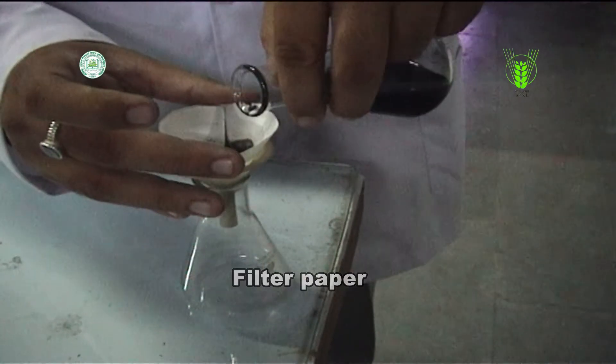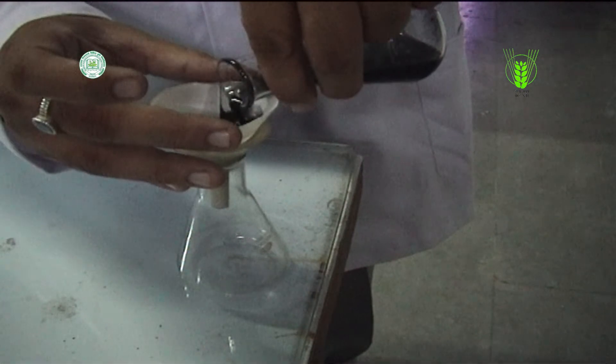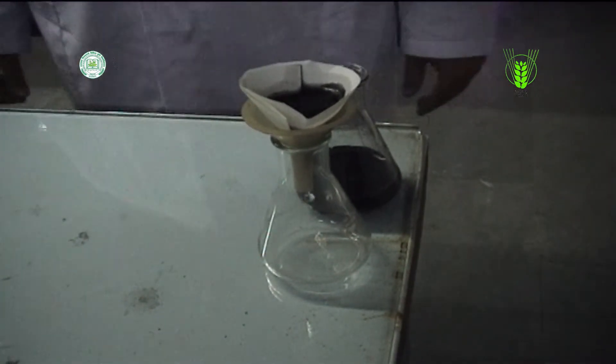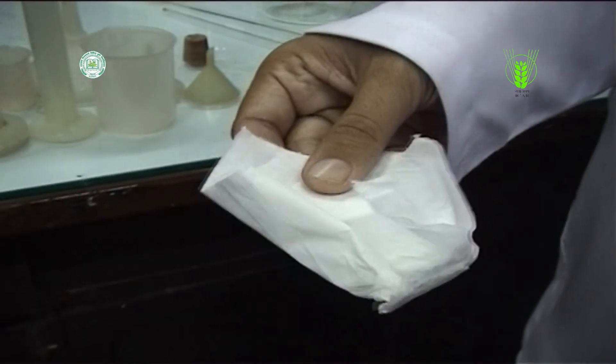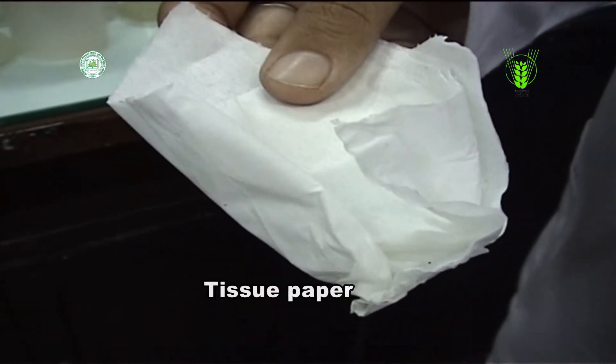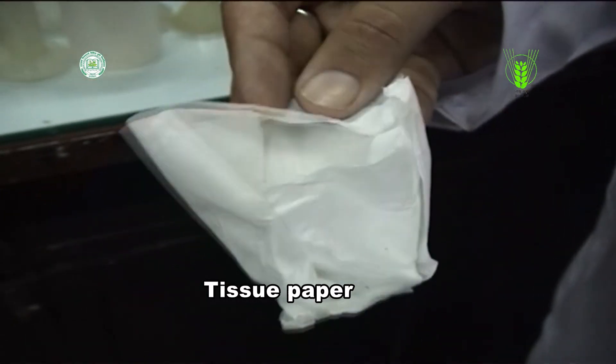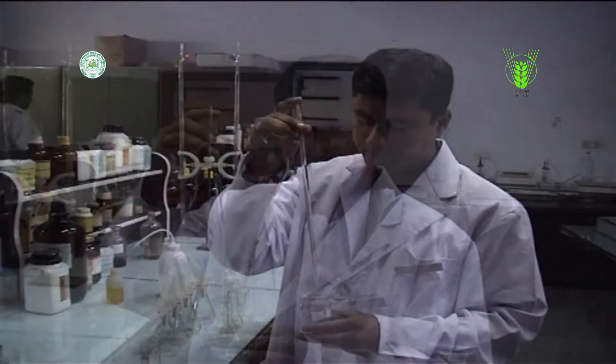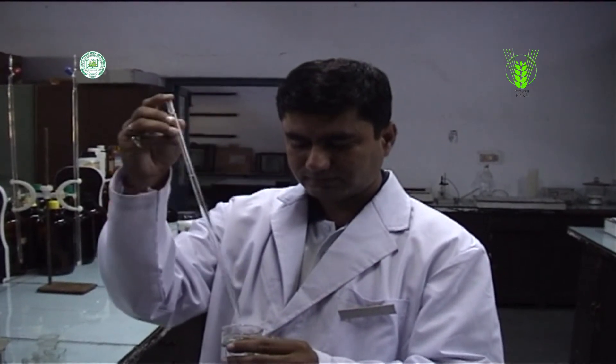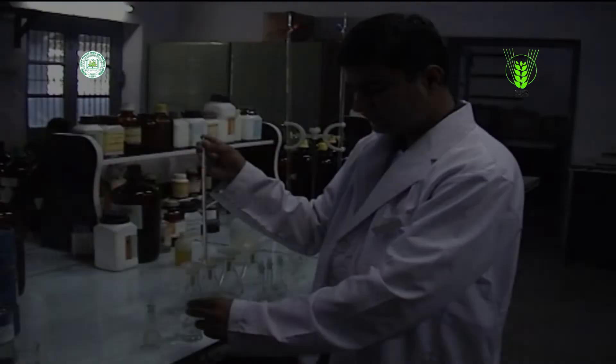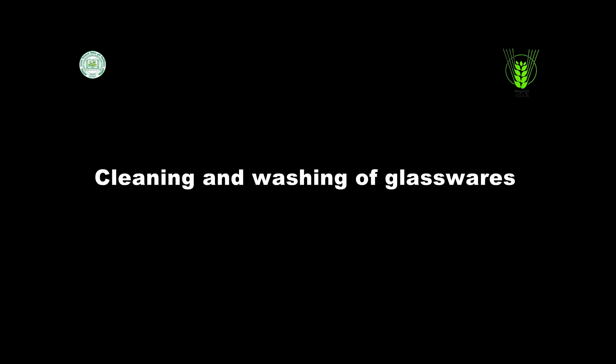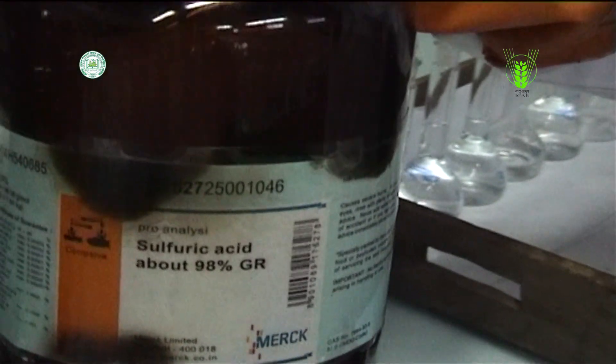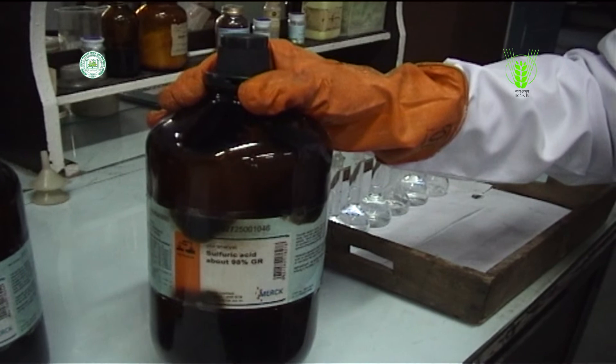Tissue paper. This is tissue paper used for cleaning and drying off burettes and pipettes. While working in a laboratory one should wear an apron in order to protect our clothes from chemicals. Use of thick hand gloves while working or washing or cleaning with acid is mandatory.